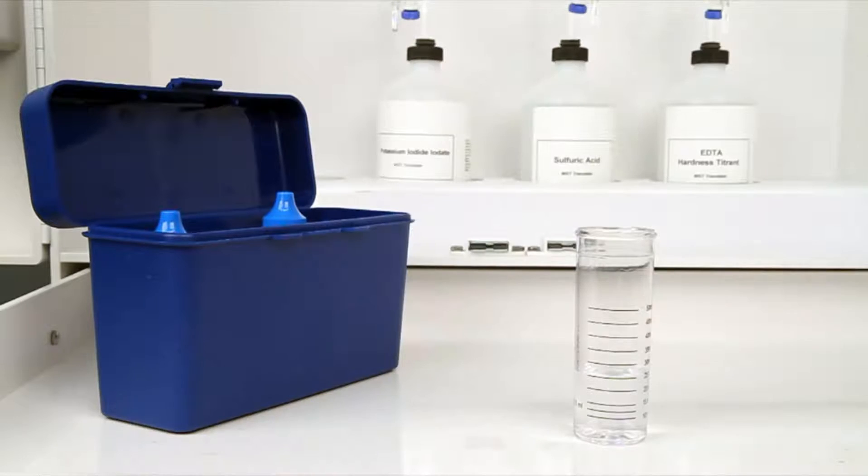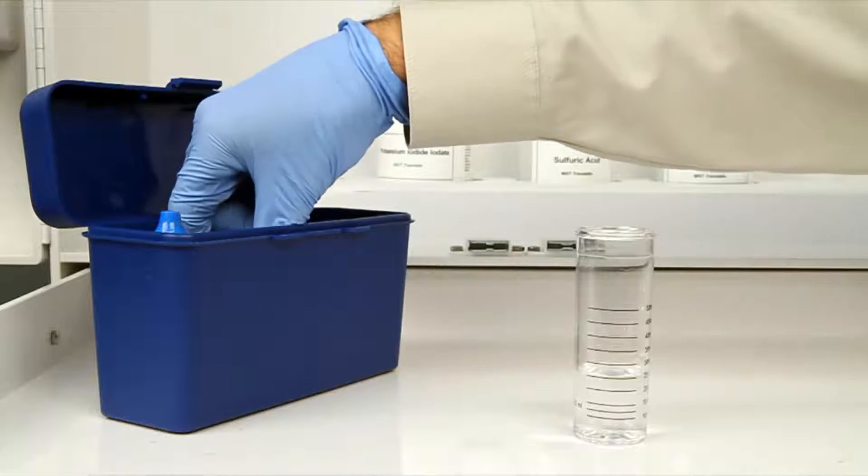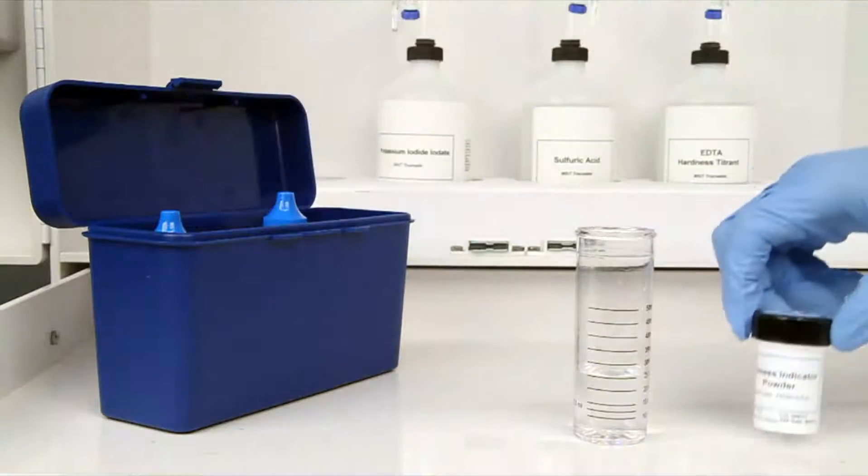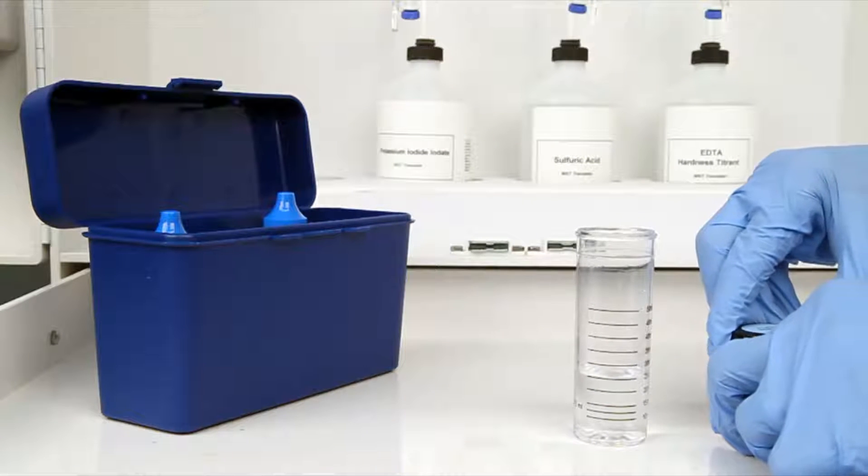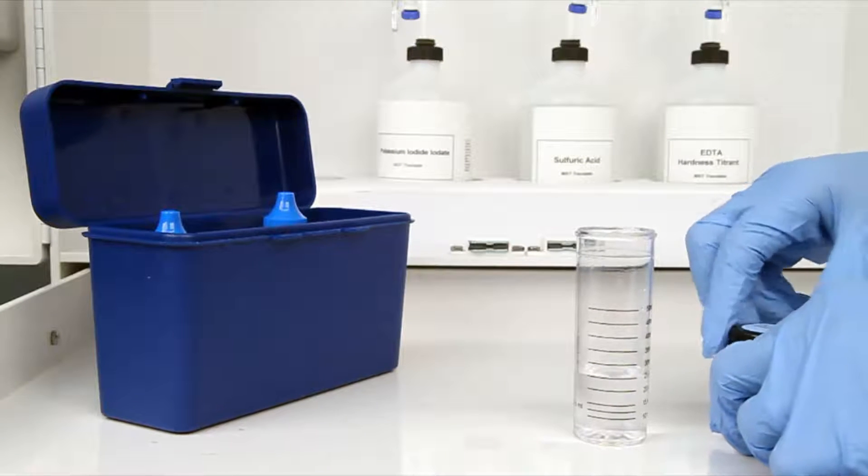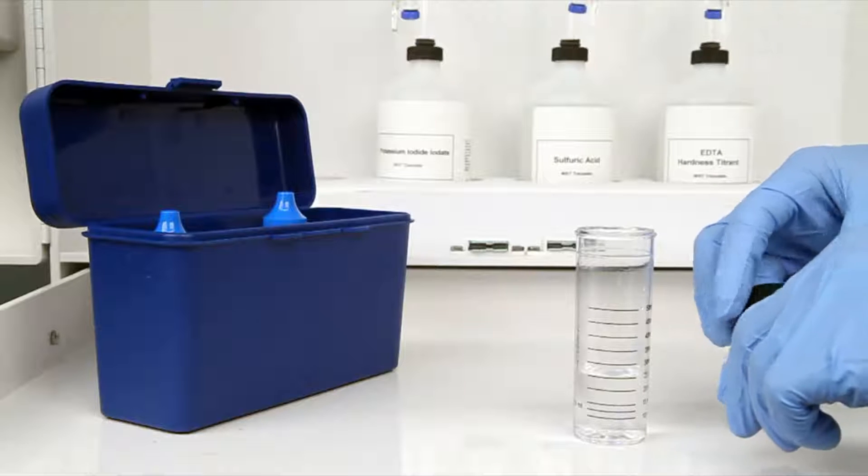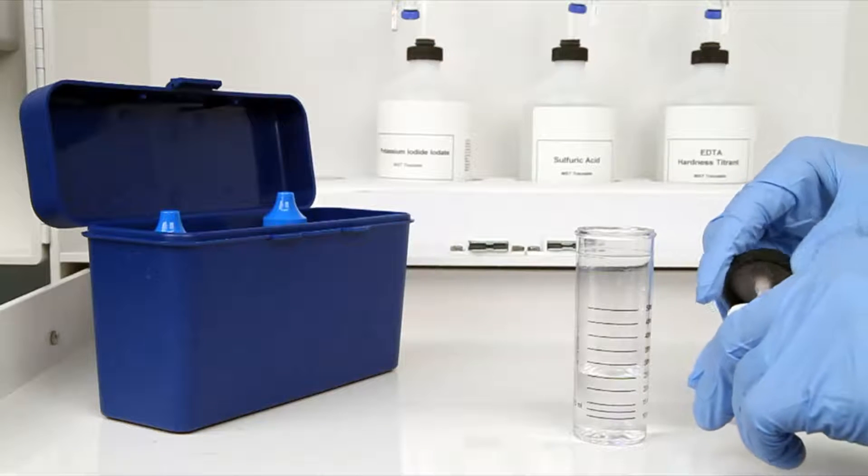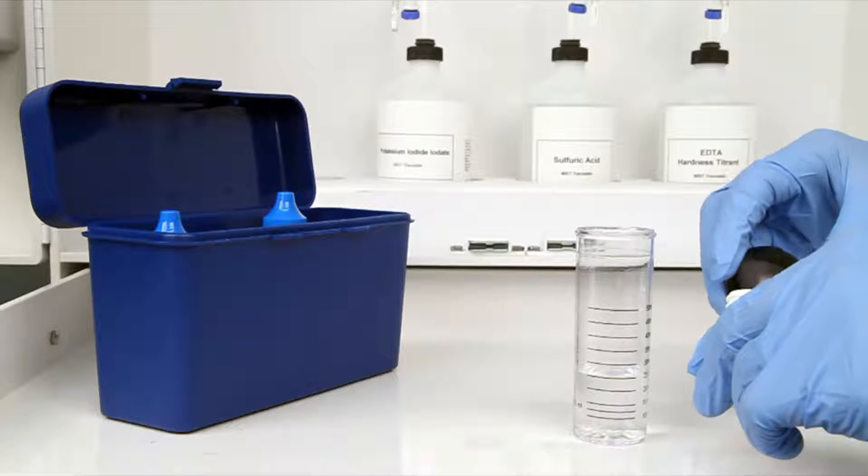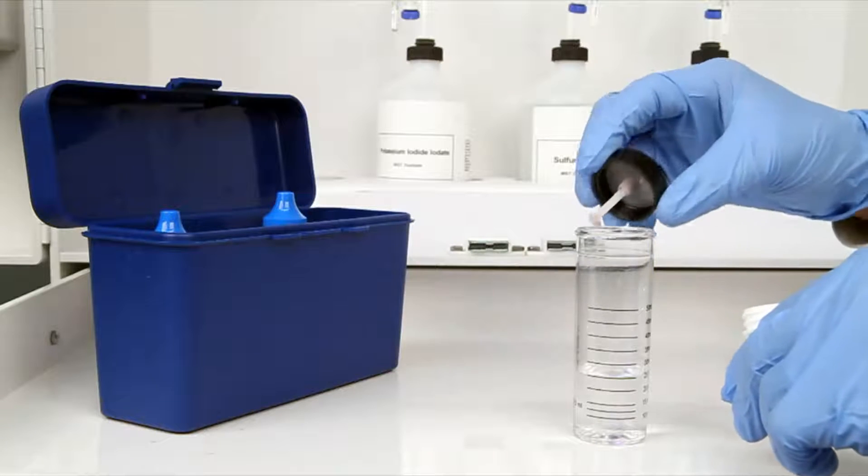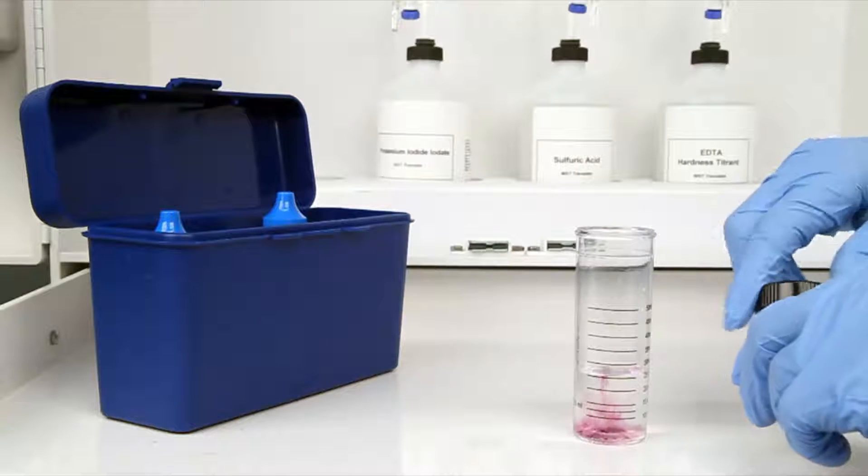The next step according to the Endpoint ID procedure is to add one scoop of hardness indicator powder. After the addition of the powder, swirl the vial to ensure the powder is completely dissolved.